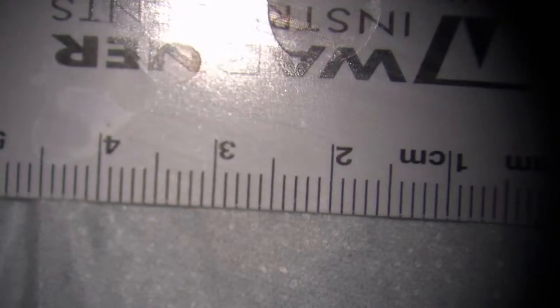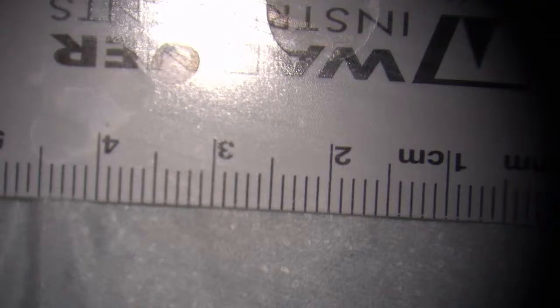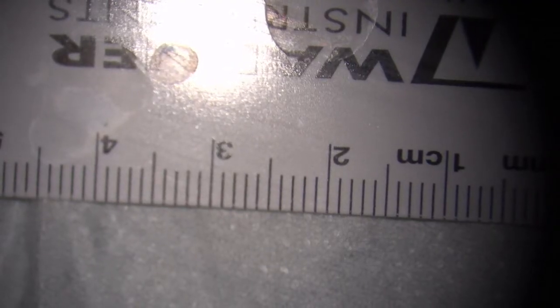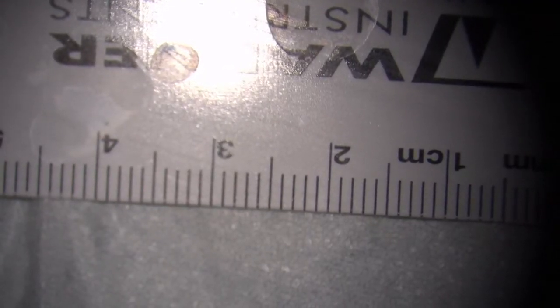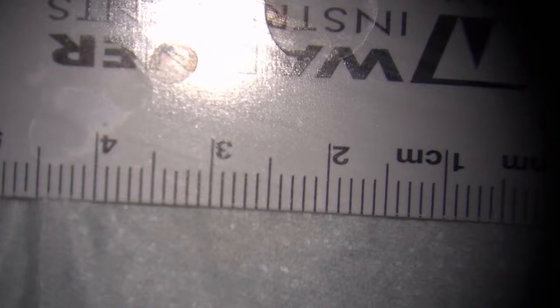Write down 4 times. Right here is 0.4, and here, 10. So now the magnification is 0.4 multiplied by 10, so it's 4. And then the diameter of the view is about 6 centimeters. You don't have to be very accurate. It's just to have an idea.